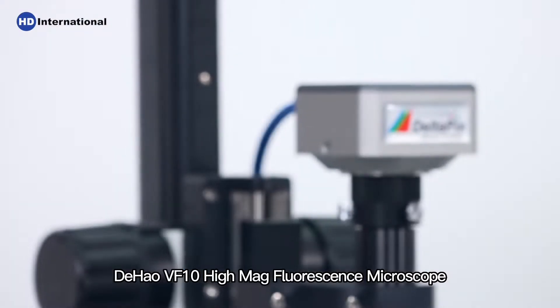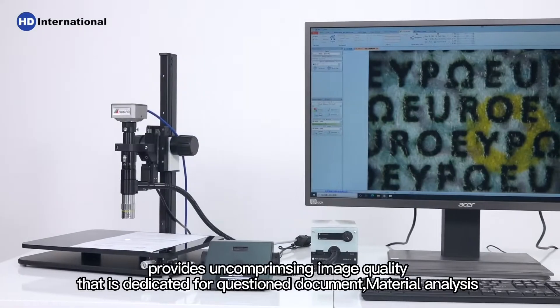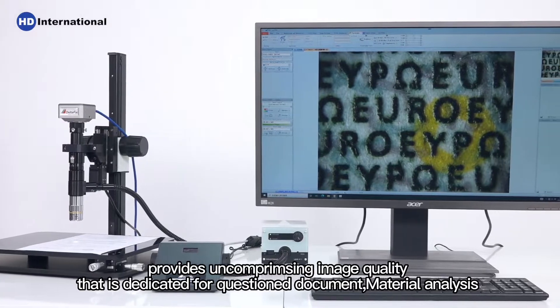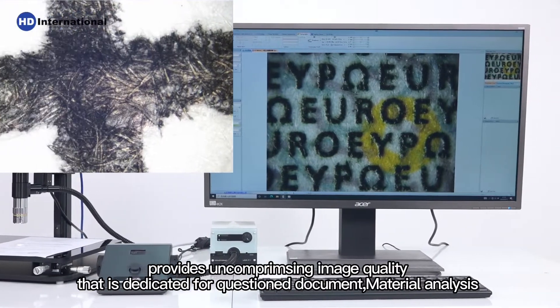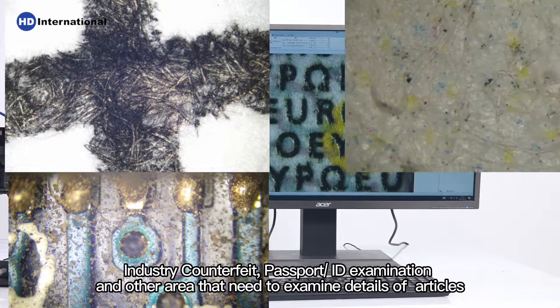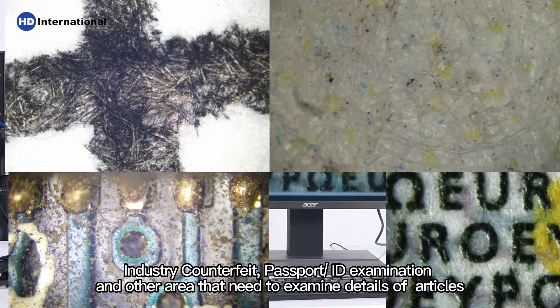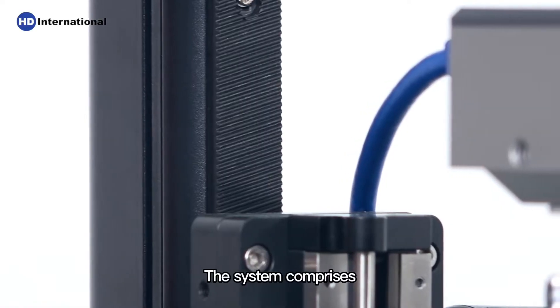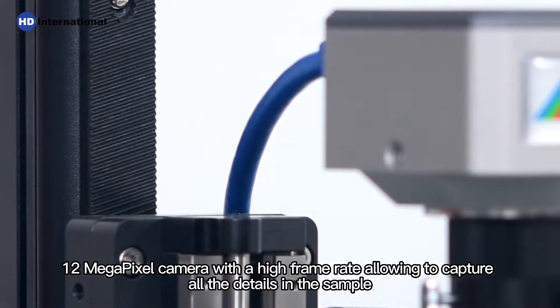The HAL VF10 High Mag Fluorescence Microscope provides uncompromising image quality dedicated for questioned document examination, material analysis, industry counterfeit detection, passport or ID card examination, and other areas that need to examine details of articles. The system comprises a 12-megapixel camera.